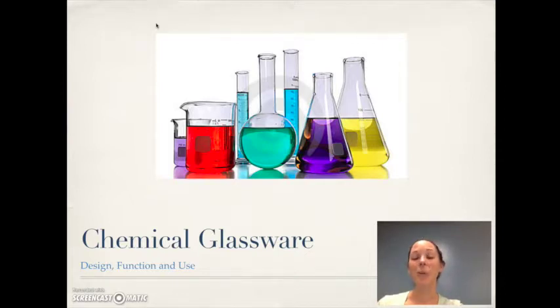Hi, this video is to help us find out a little bit more about the chemical glassware that we're going to be using in the density lab, as well as glassware that we're going to be using throughout the year.